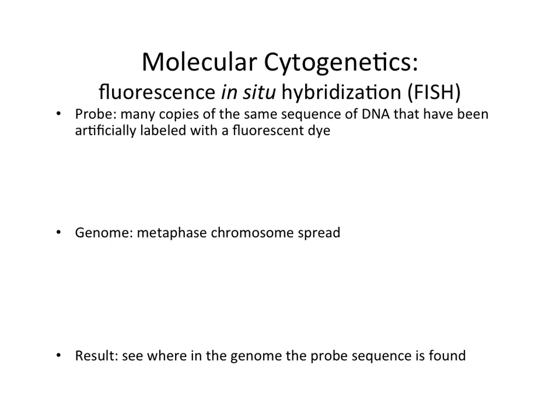And to perform FISH, we need a couple of things. One thing we need is a probe. And a probe is, as it says here, a piece of DNA that we have artificially made fluorescent. So in this case, I'm going to diagram this probe as a red fluorescent piece of DNA. And initially, it's a double-stranded piece of DNA. So I'm going to highlight this in red because it's presumably a molecule that emits red fluorescence.